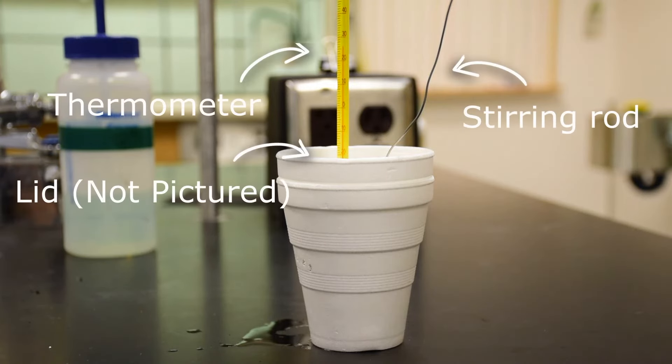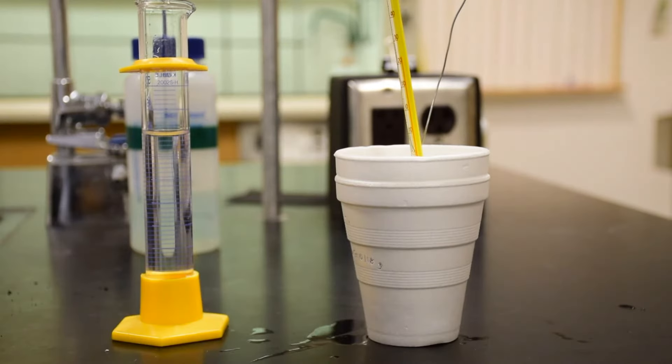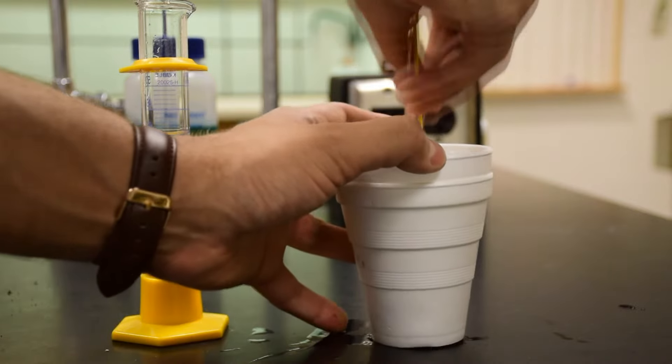Set up the coffee cup calorimeter as shown. Using a graduated cylinder, add distilled water to the coffee cup calorimeter. It is up to you to determine how much water to use.